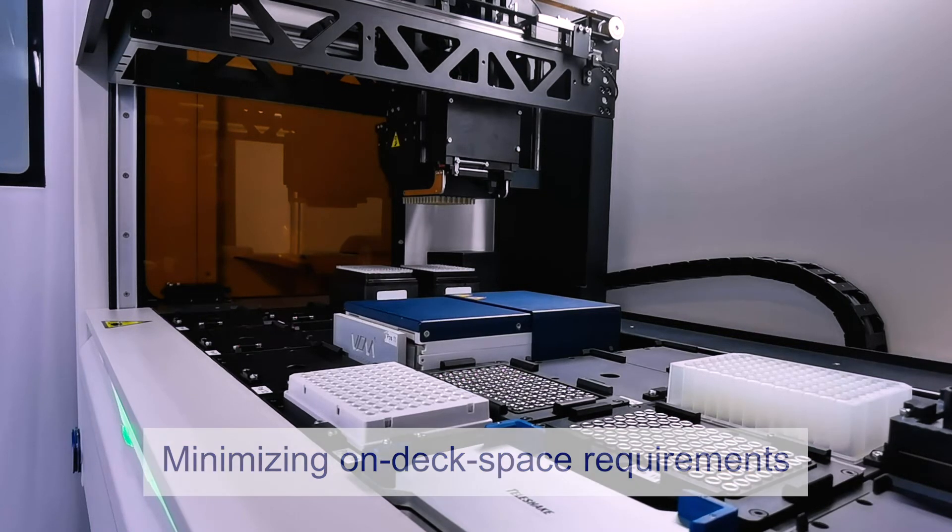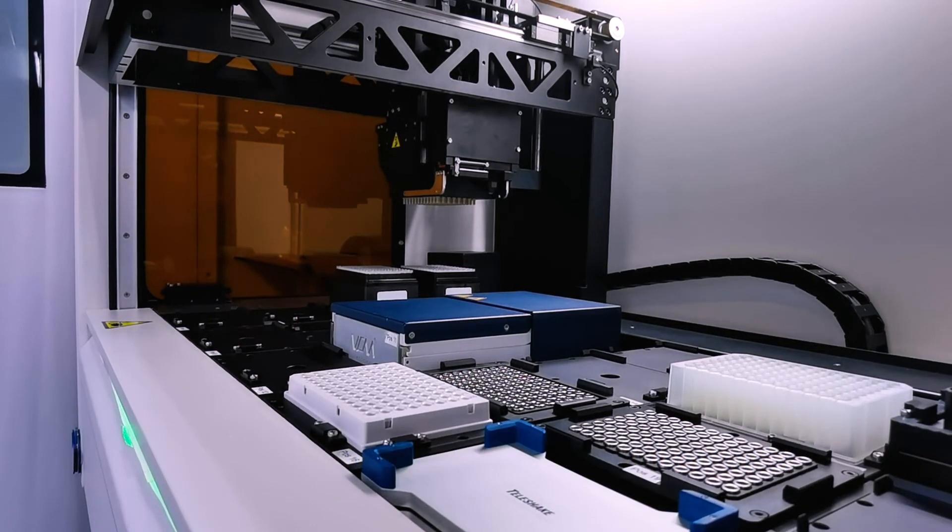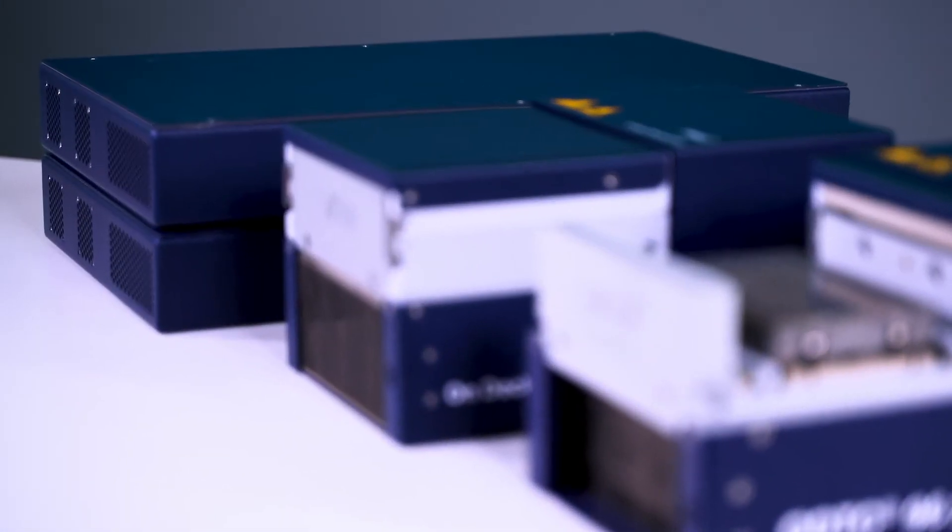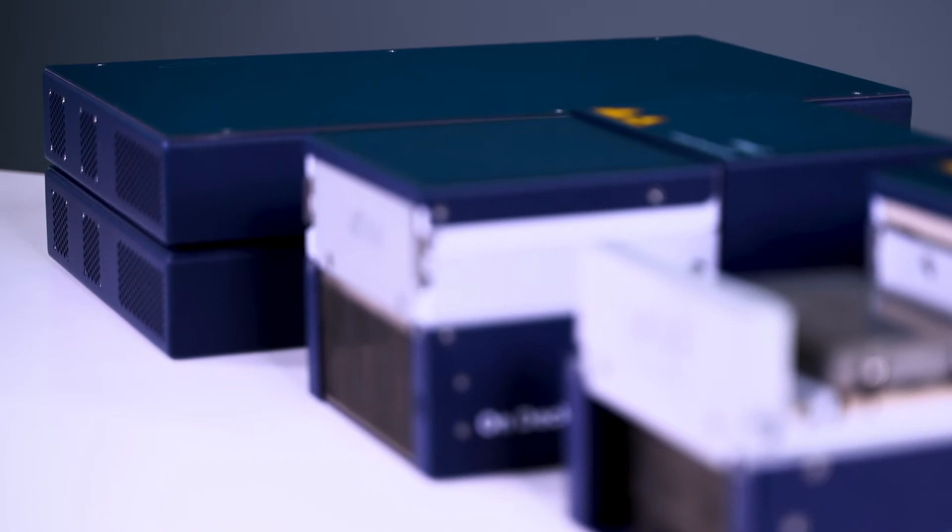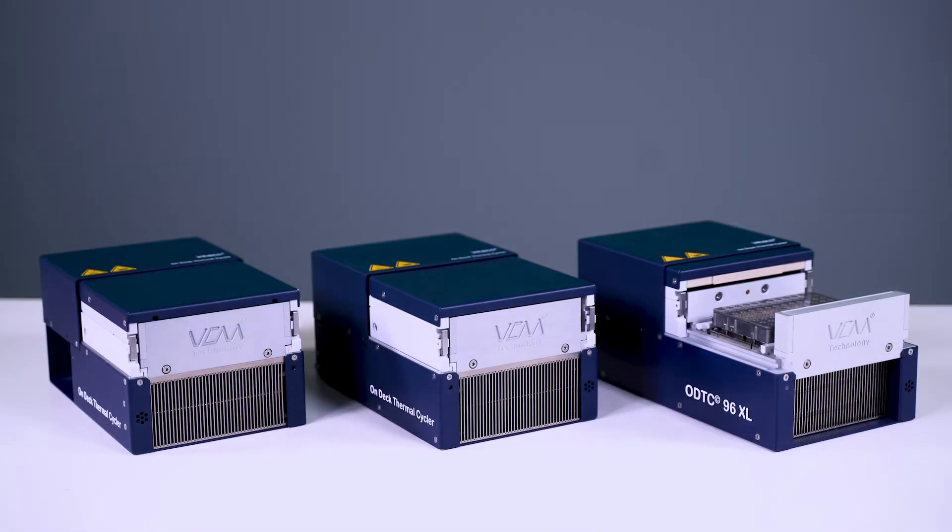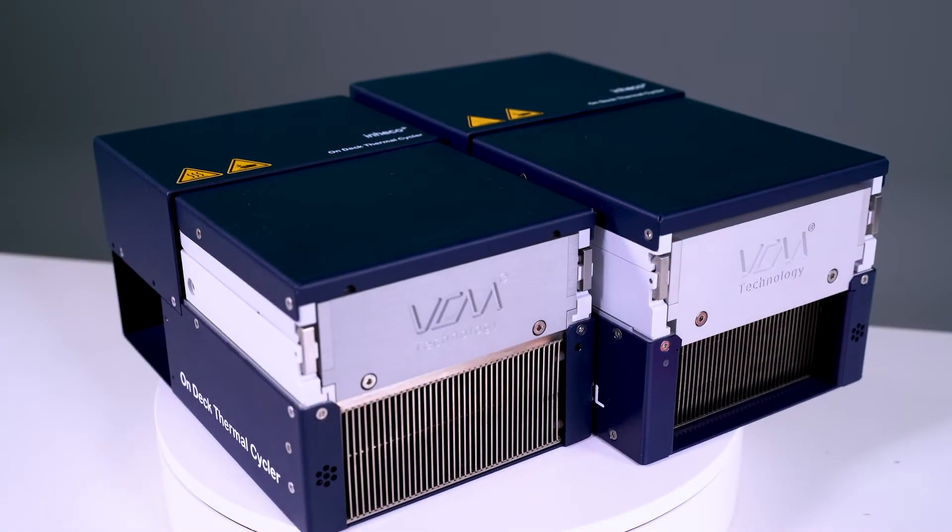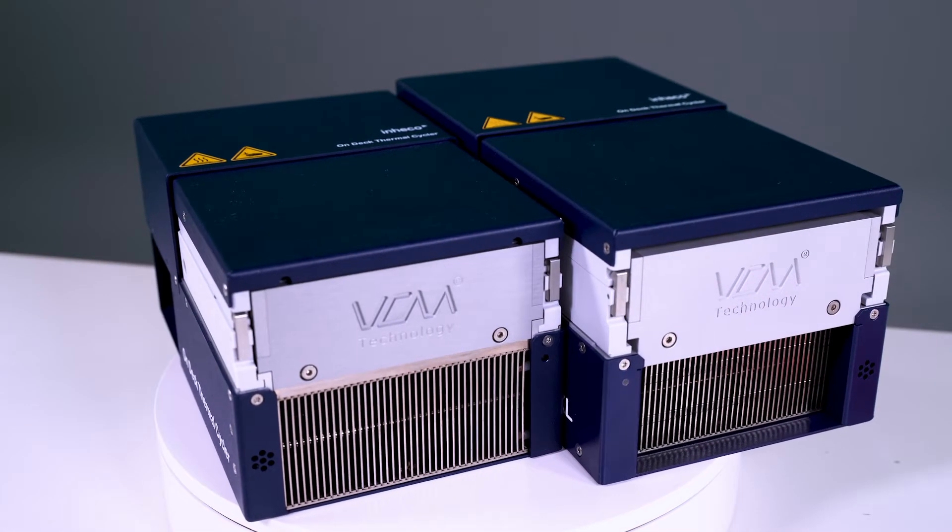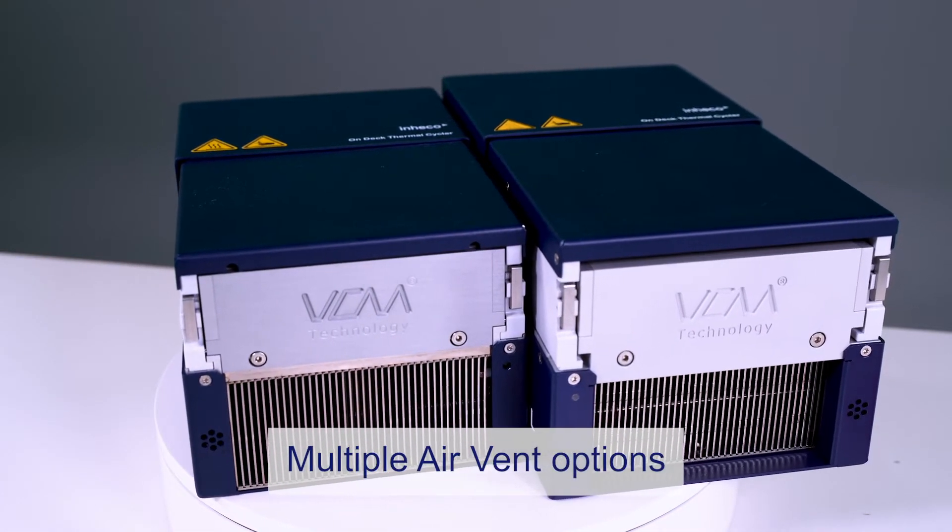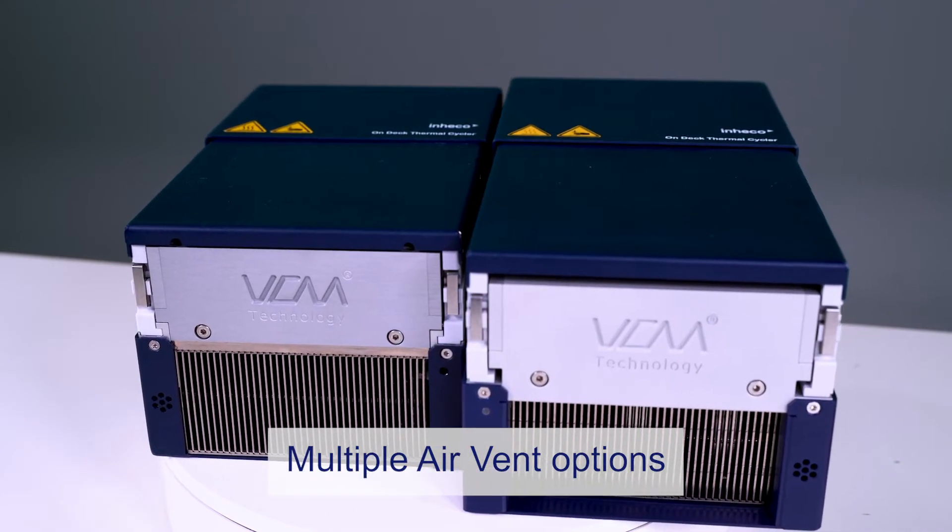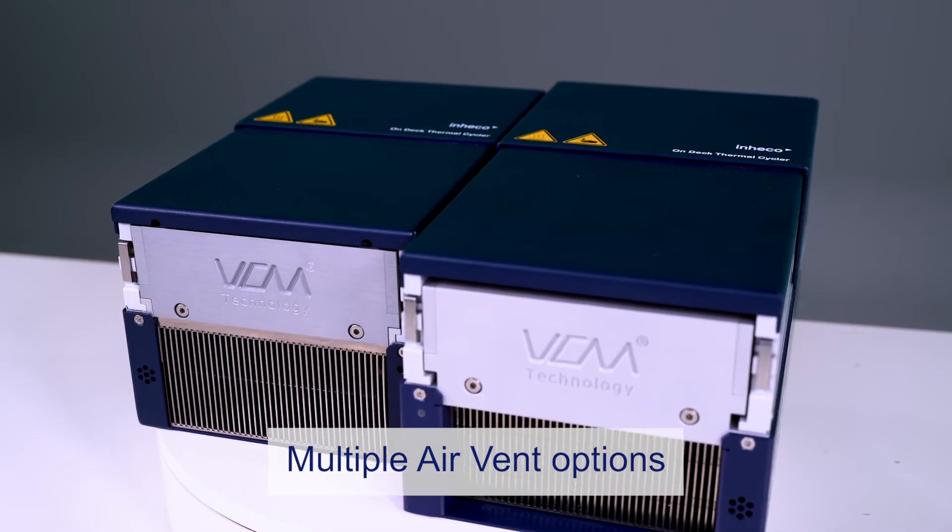The separate off-deck control units further minimize on-deck space, noise, and temperature generation. We offer our thermal cycler with four key variants: a 96 and 384 well solution available in standard and XL sizes. Multi-air vent options enable the cycler to be placed at any point on deck regardless of the surrounding devices.